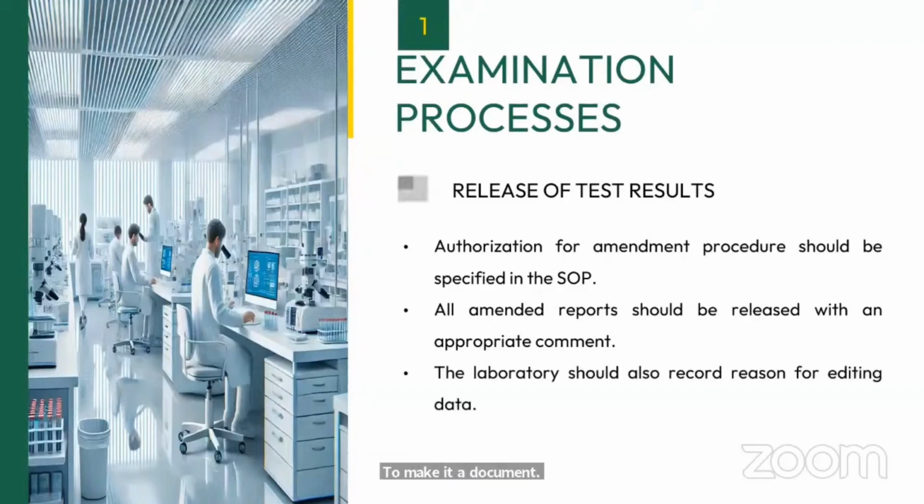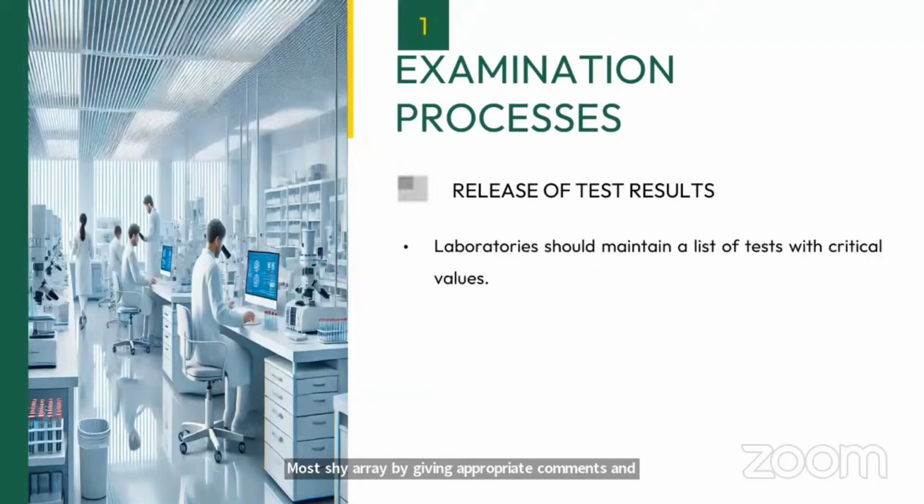The laboratory should also record the reason for editing the data. Now, whenever you are changing, record the reason why you are going to amend the examination, why you are going to change the report. So, you should not shy away from giving appropriate comments and appropriate reasons for amending any of the test results. The laboratory should maintain a list of tests with critical value.